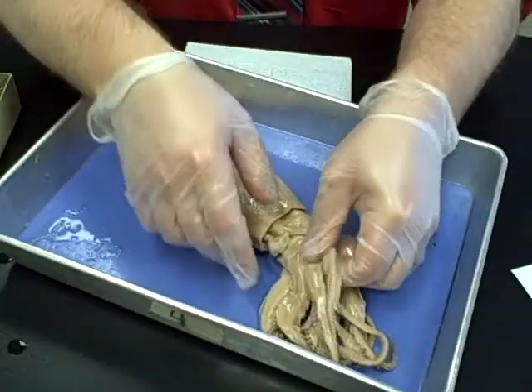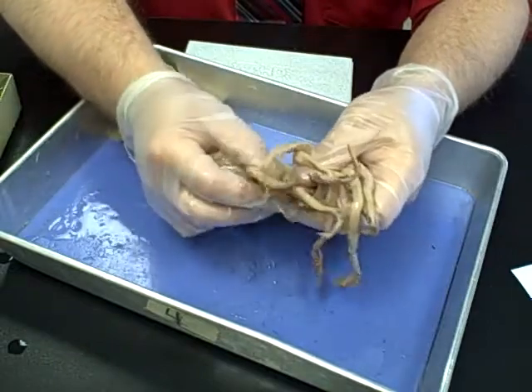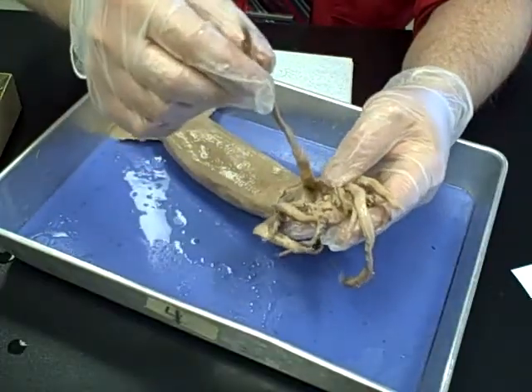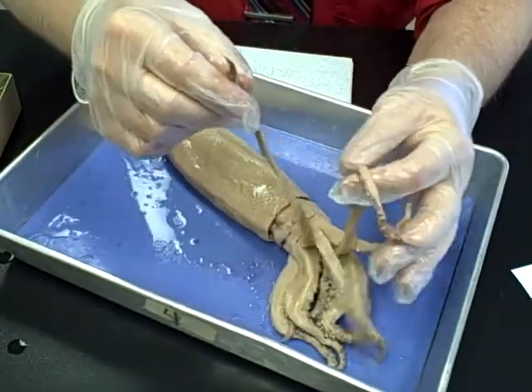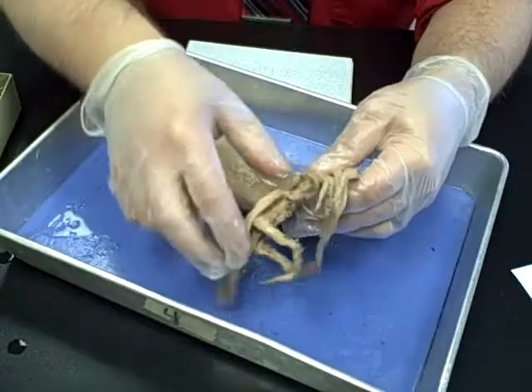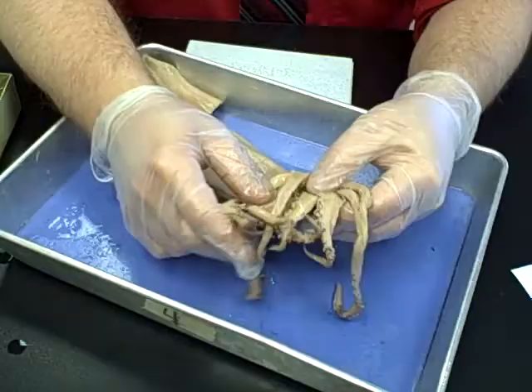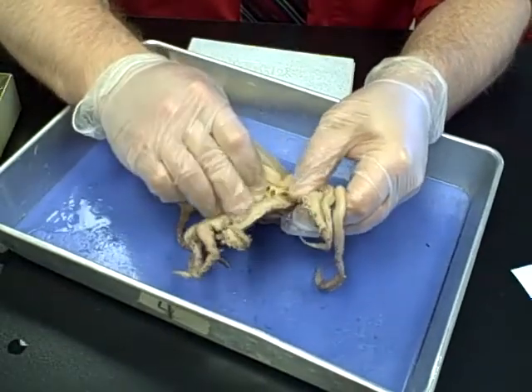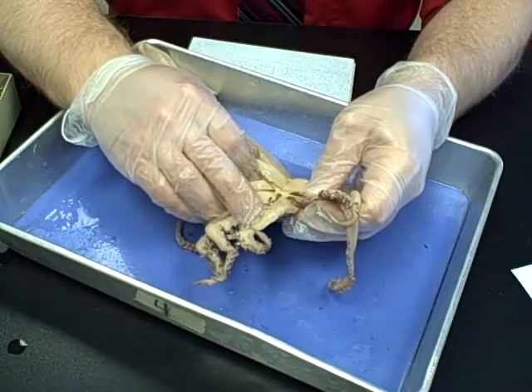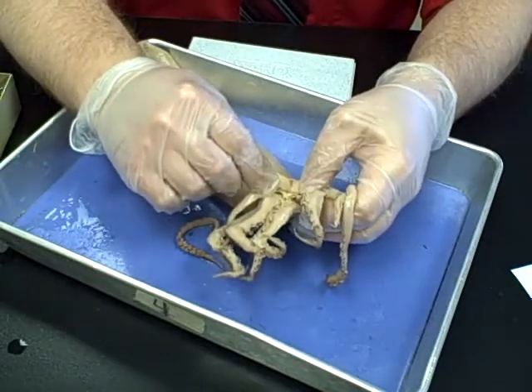Speaking of the appendages, there are ten of them altogether. The shorter, stubbier ones are the arms. The tentacles — there are only two of them — are a little bit longer and thinner. So you should have two long tentacles and eight short arms. If you open them up a little bit, the mouth and the beak are on the inside. The beak is kind of dark, and the mouth is used to push food in while they're eating.